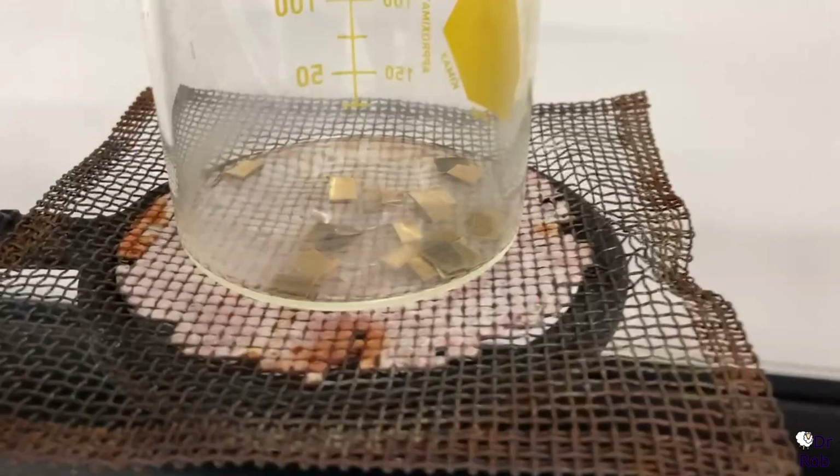All right, we're going to look here at a reaction of brass and nitric acid. This is a pretty commonly done reaction in schools. It gives students an opportunity to use some chemistry equipment and produce a really cool looking reaction. And how we do it is we also then have the students determine the amount of copper in the brass, and they use absorbance for that. So it gives them an opportunity to use a small instrument too.